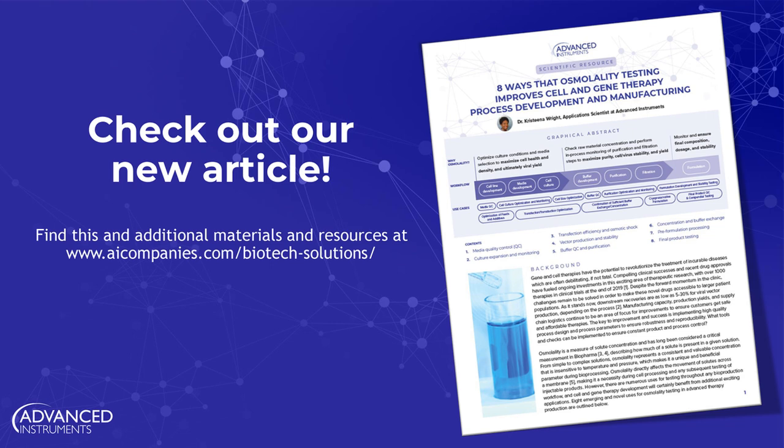And kind of start with that, but we completely recognize that the other things, potassium and glucose, matter too. I think I mentioned that the media sugar levels, when we're looking at the sugar metabolism, affect vector stability, so it is definitely affected by sugar levels as well. If you're interested in doing an exploratory study, I would say start with salt, to start with sodium.